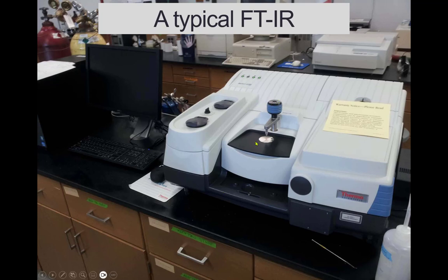This particular instrument has a solid sample attachment. You may find them with this attached, or this entire piece can come out and we can put samples in a different kind of a sample holder to do liquid samples.